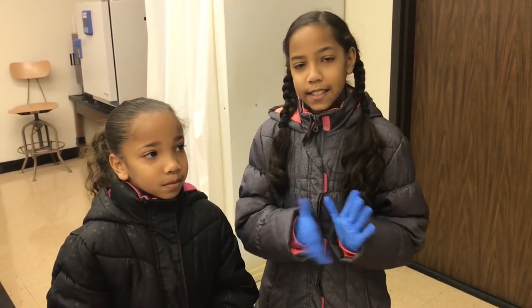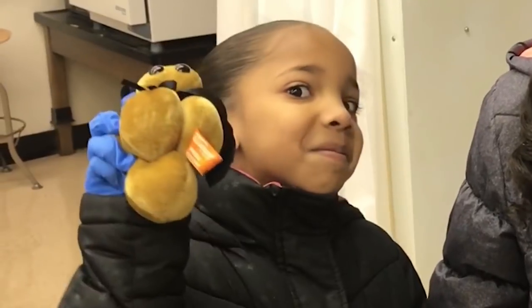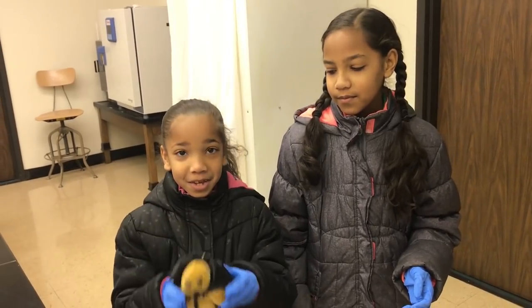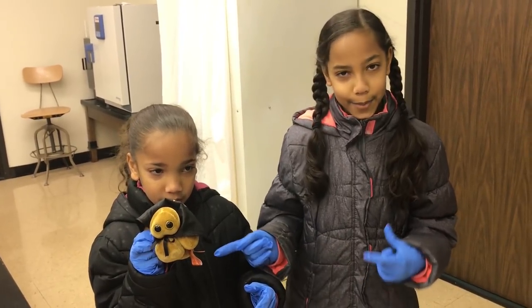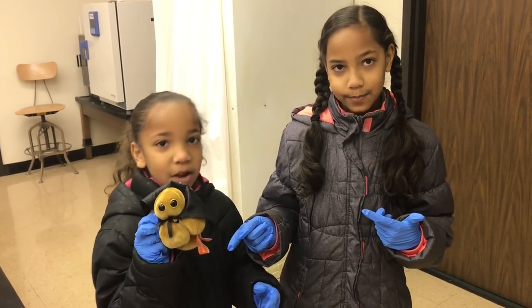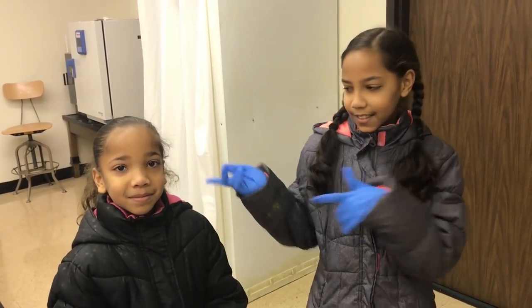Okay, so Staph. One of the strains of Staph is MRSA. MRSA is a superbug. This is cute, but it's not what you think. It's a bad bug, I tell you. A very bad bug. Okay, let's start testing.